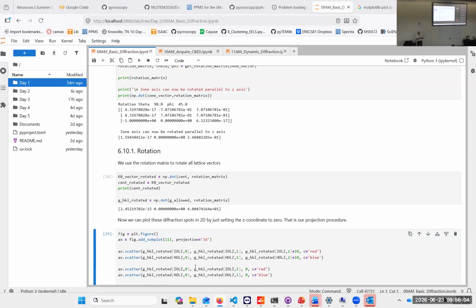Now, if you're in exact Bragg conditions, what really happens is multiple scattering. And so you see the Kikuchi lines actually as bands. So I keep your question here till we see it on the microscope.